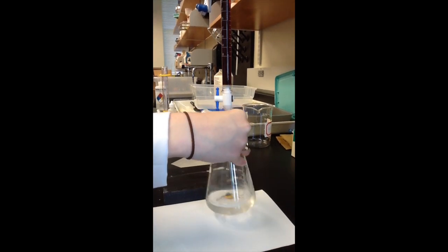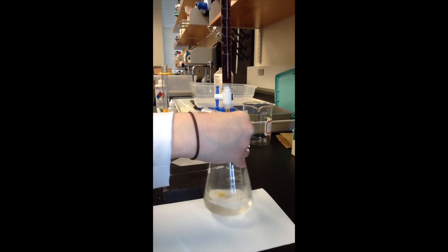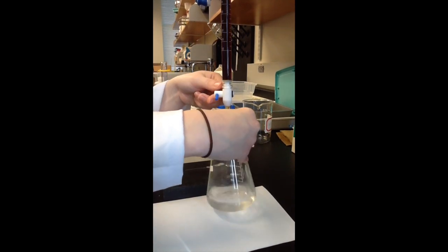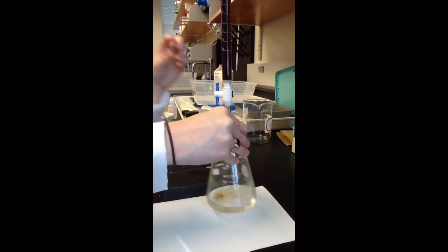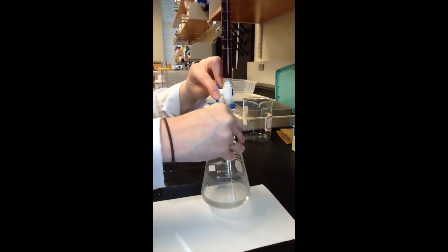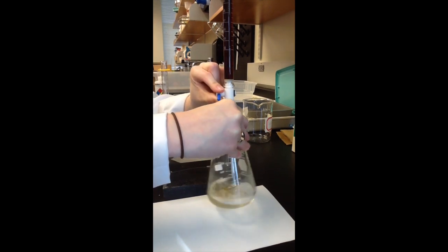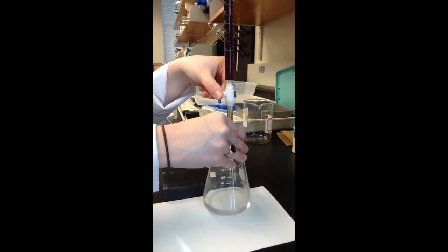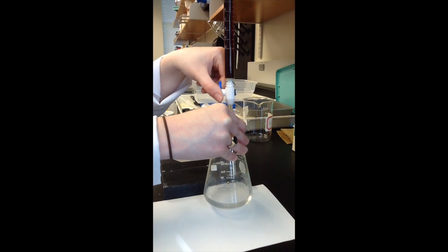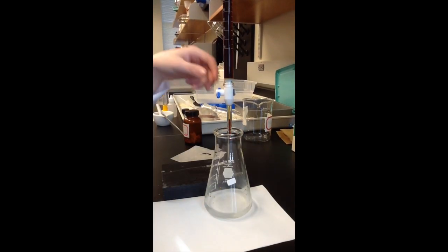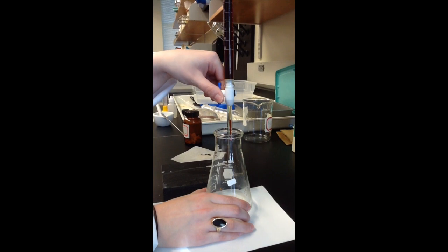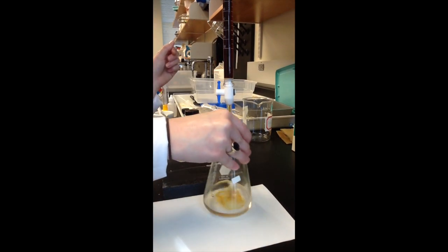Slowly turn the stopcock until the iodine begins to drip out. While the iodine is dripping into the flask, swirl the flask to mix the solution. Do this until you see a permanent color change. When you see a color change, close the stopcock and record the final volume of the burette. Repeat this titration two more times, filling the burette back up with iodine each time and recording the initial and final volumes.